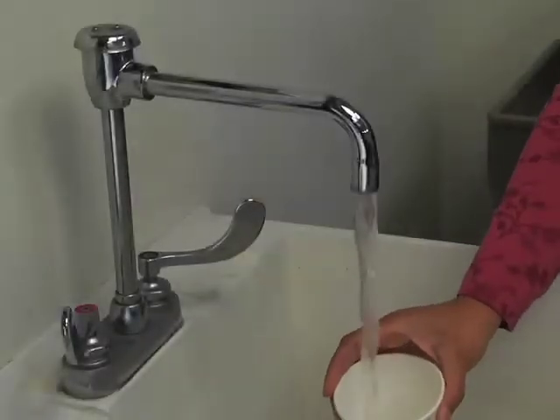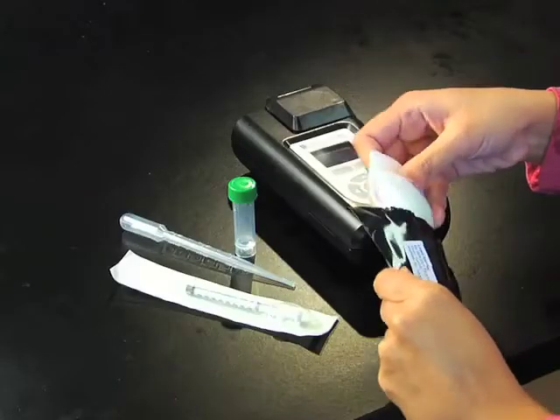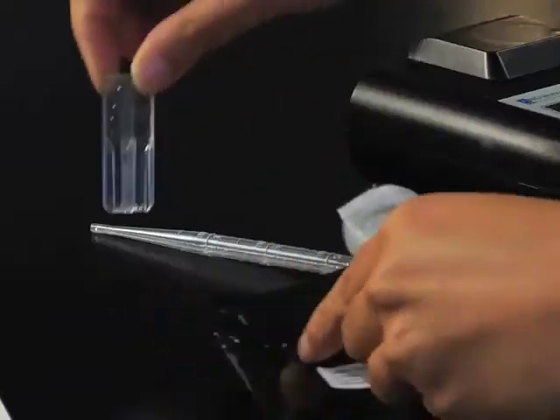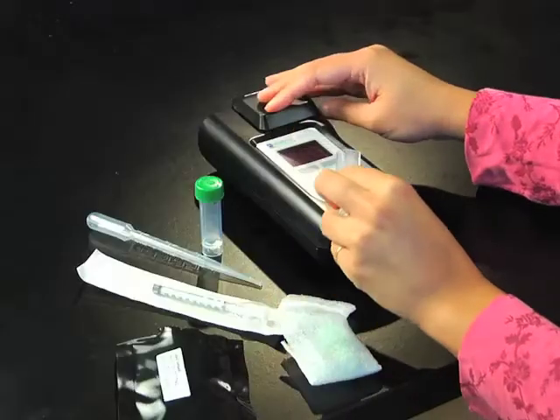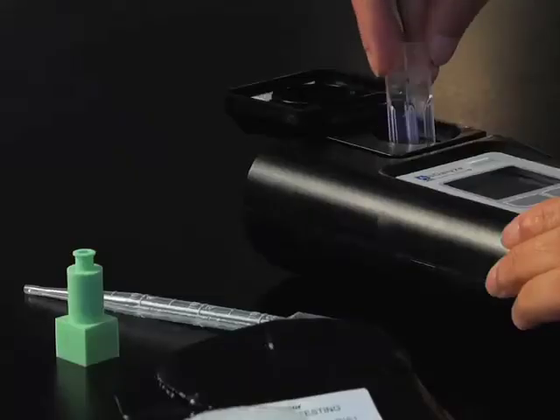Take the sample of water to be tested. Unpackage the sensor, cuvette, syringe, and sample tube. Place the sensor and cuvette in place with the arrow on the cuvette facing you.